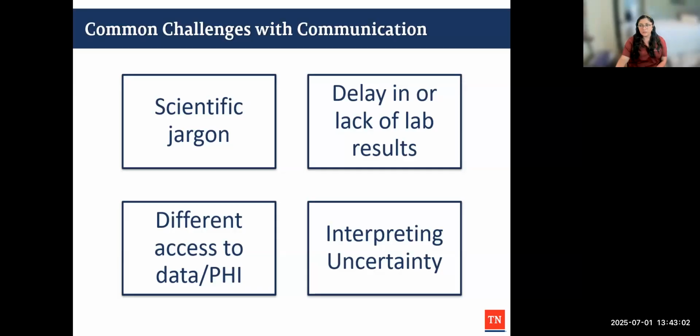One thing that isn't necessarily a result of the sequencing itself, but we see this with lab testing and communicating lab information during outbreaks more broadly, is that there can be quite a bit of time lag from isolate submission to sequencing and analysis. In that intervening time, maybe you can give a preliminary result, but maybe you can't, depending on your rules.